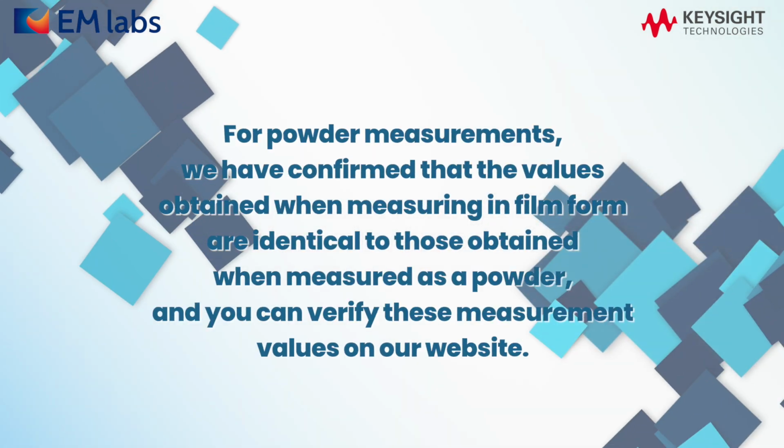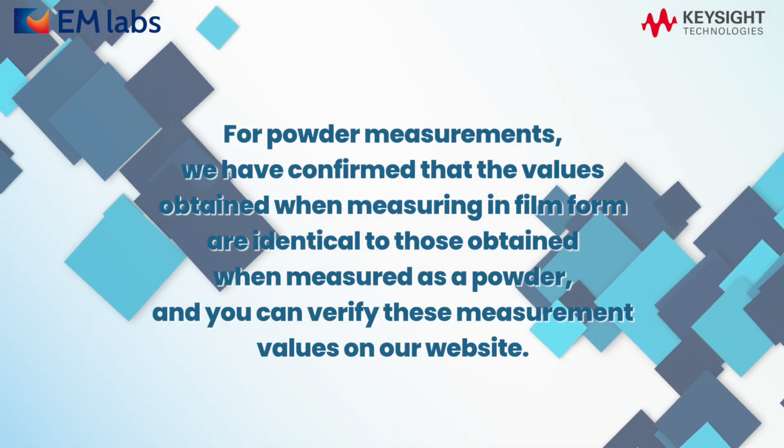For powder measurements, we have confirmed that the values obtained when measuring in film form are identical to those obtained when measured as a powder, and you can verify these measurement values on our website.